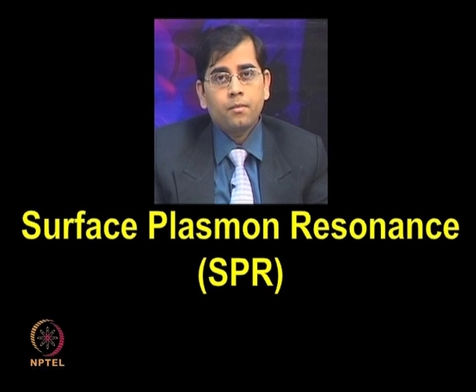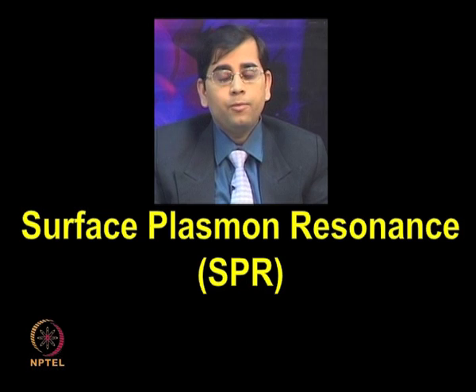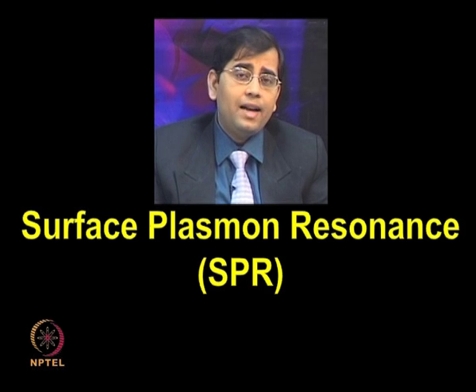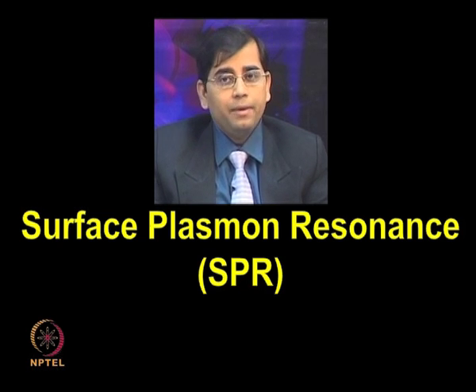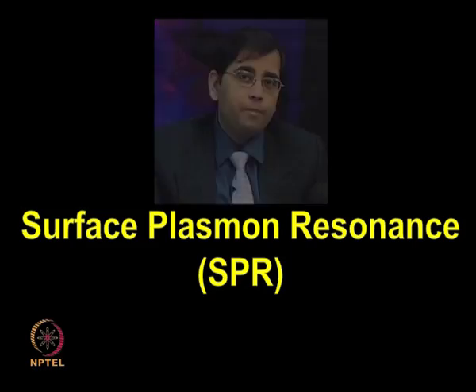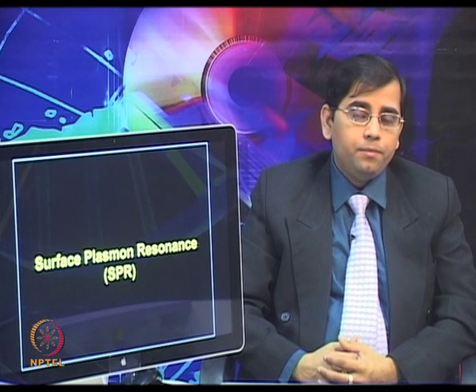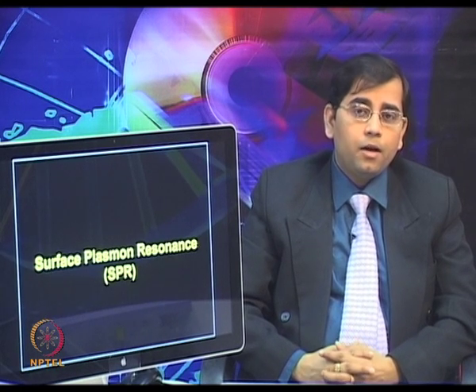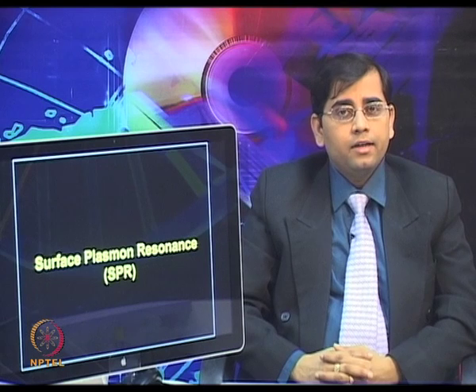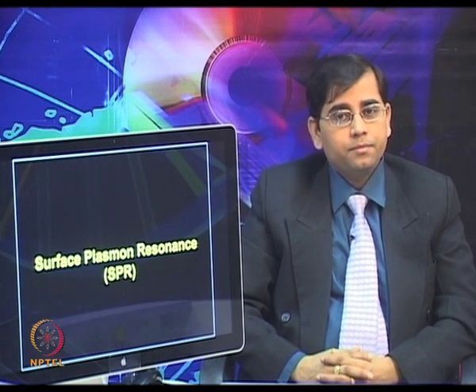The optical methods based on surface plasmon resonance and evanescent waves are promising methods to provide kinetic resolution of binding reactions in a label-free manner. Surface plasmon resonance spectroscopy based sensors are popular because of their simple instrumentation and high sensitivity.